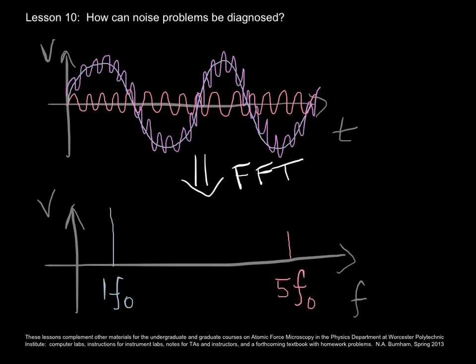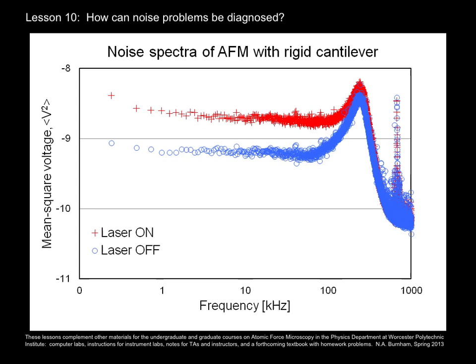This is important because when you're diagnosing noise, it is easier to think about what might be vibrating at what frequency than to look at a time domain signal and figure out what's going on. Let's take a look at some real data.